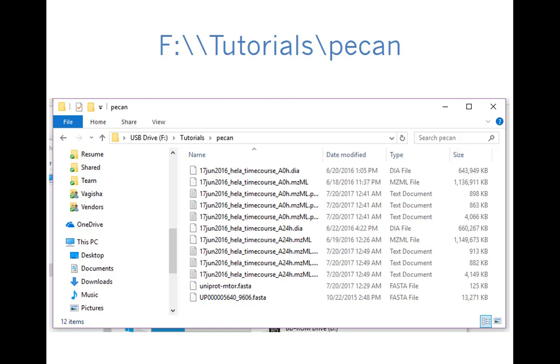Do you guys have any trouble finding it? Anyone not able to find this? Great. Okay. So there were two files that I had you download. One was a PDF, and the other one was a dot jar, and that's a Java executable file.